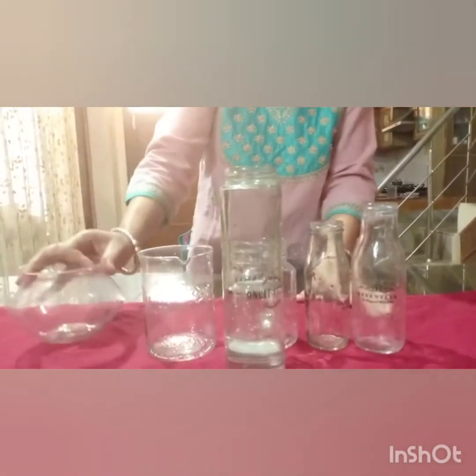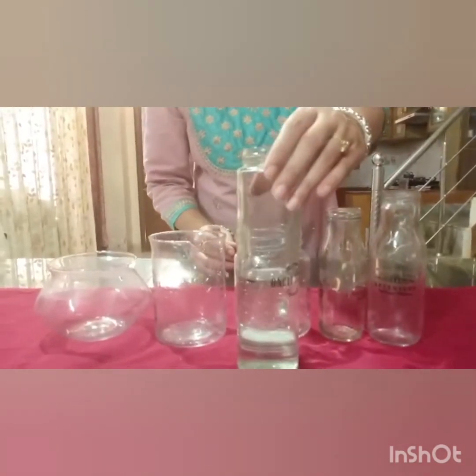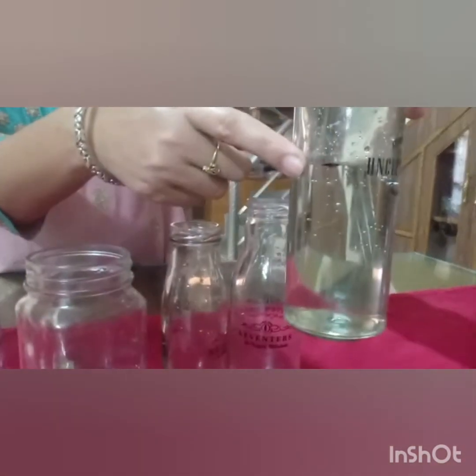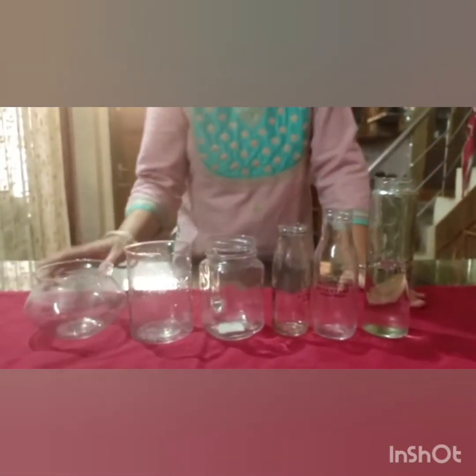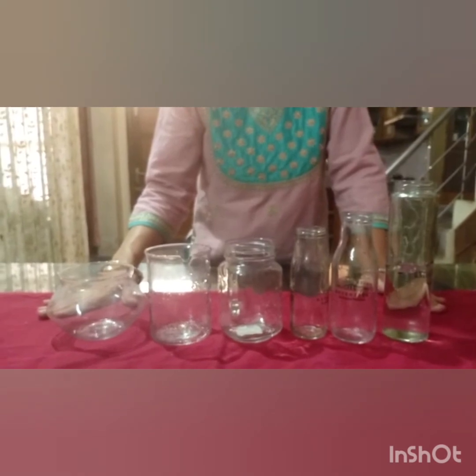There are a few drops of water which remain in the vessels, but still we expect that the final and initial volume of the liquid should be the same. See, it has reached the same black mark here. So this shows that the liquids have definite volume but indefinite shape. So this is the result of the experiment. Thank you.